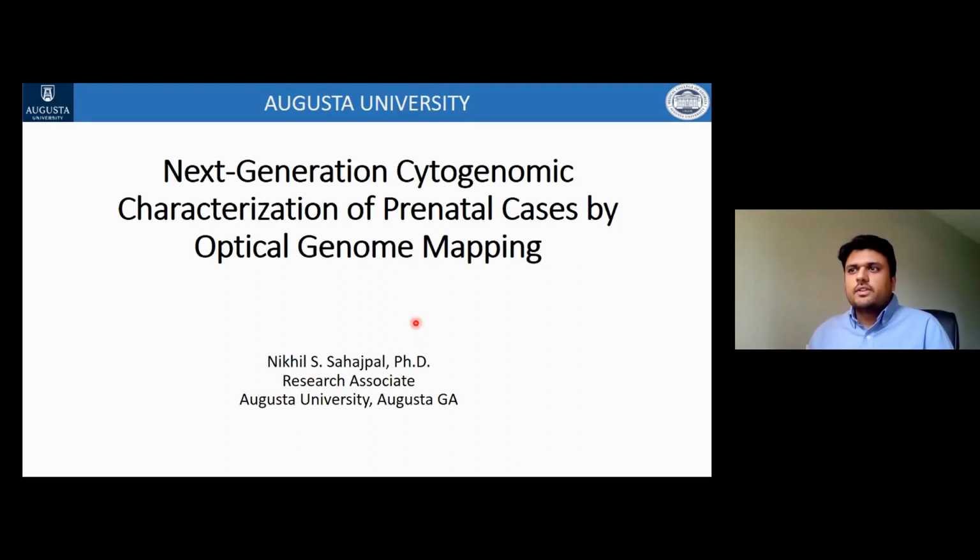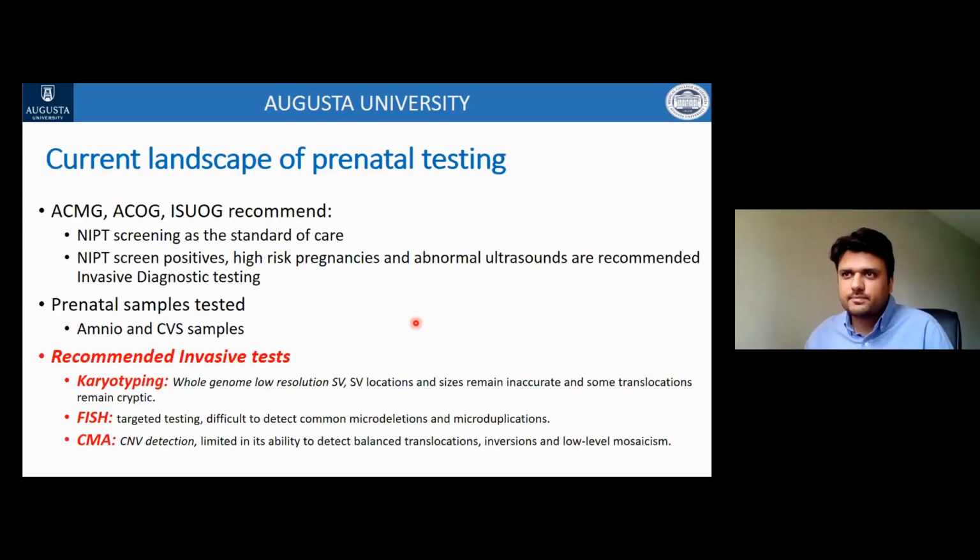I will be talking about next generation cytogenomics. And before I begin, I would like to say that the term next generation cytogenomics has rather become synonymous with BioNano's optical genome mapping. To put that in context, I will be discussing the utility of optical genome mapping in the characterization of prenatal cases.